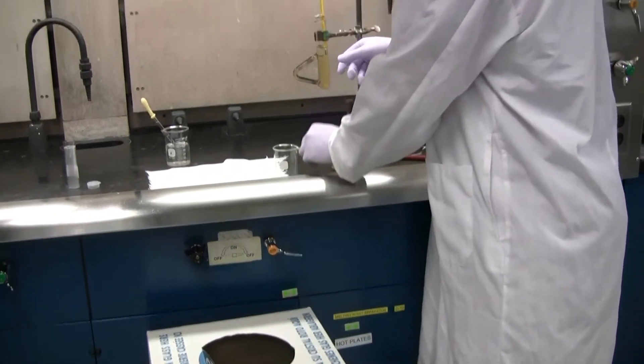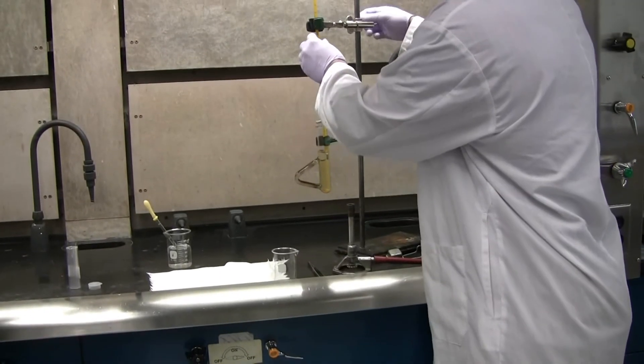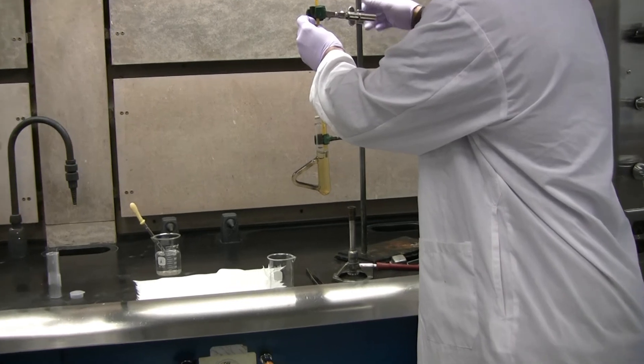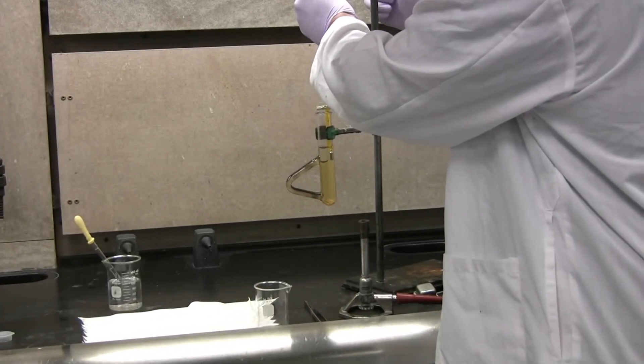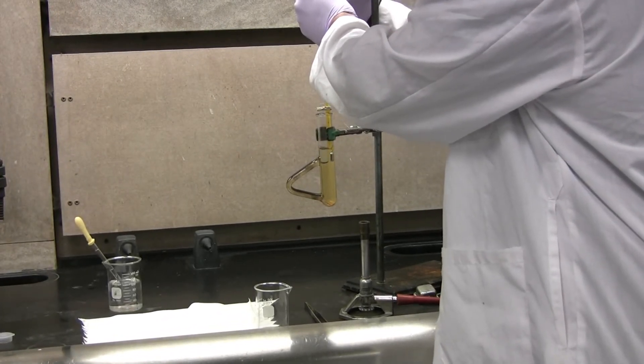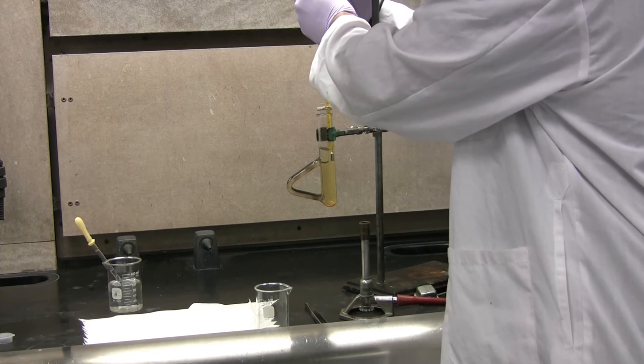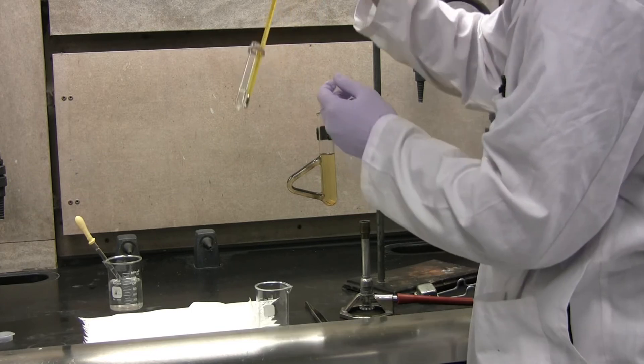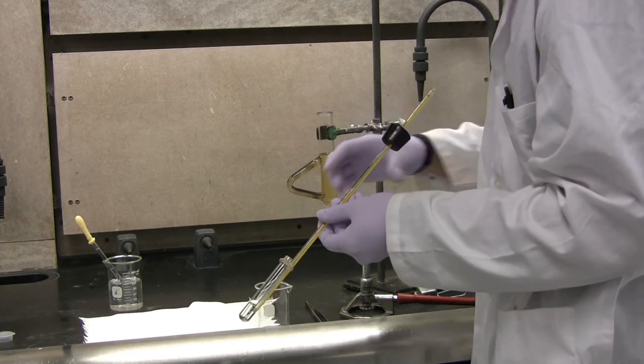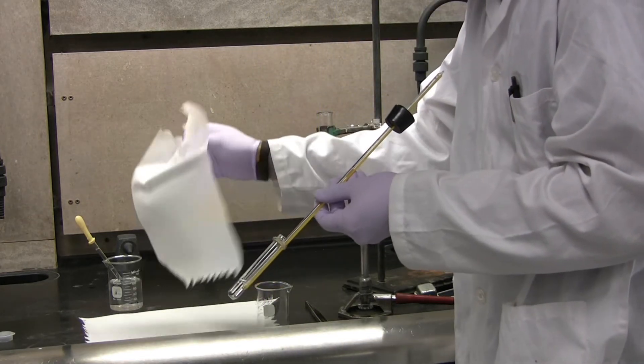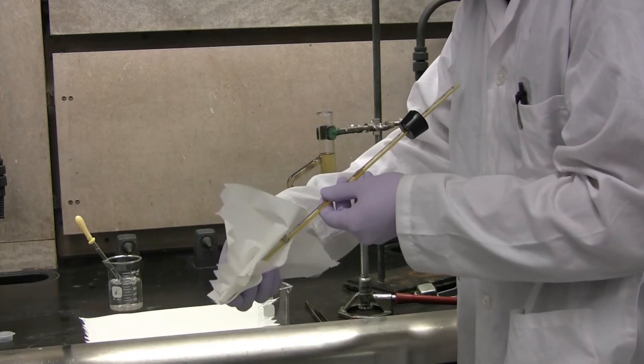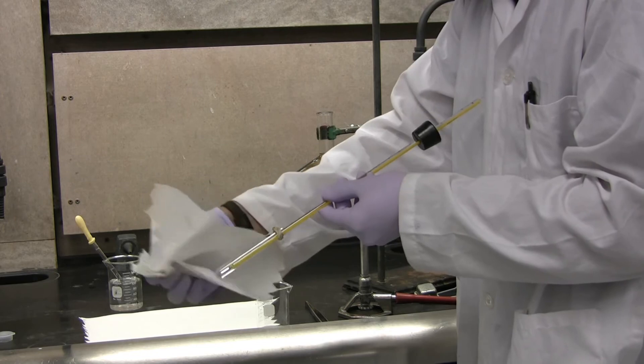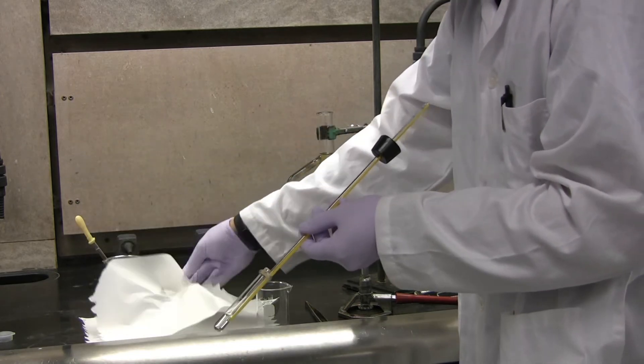The thermometer rig will be disassembled and removed from the clamp. Once removed, you will need to clean the bottom of the mercury thermometer and test tube with a paper towel. The rubber stopper will be removed.